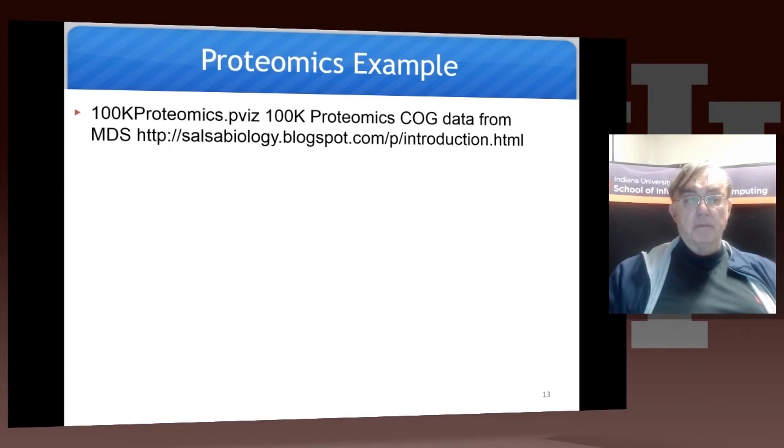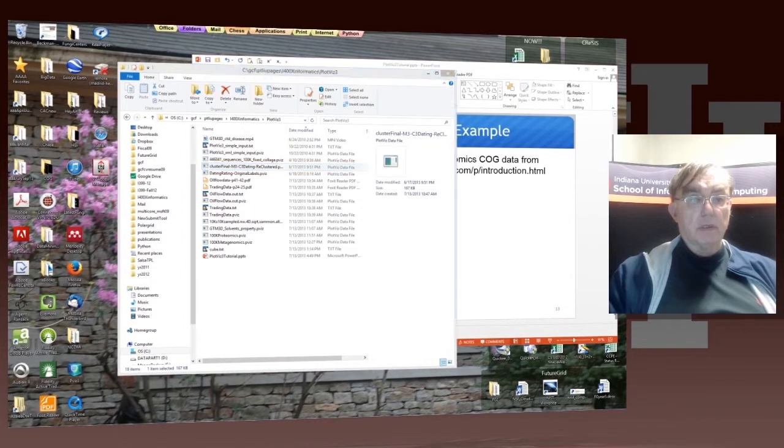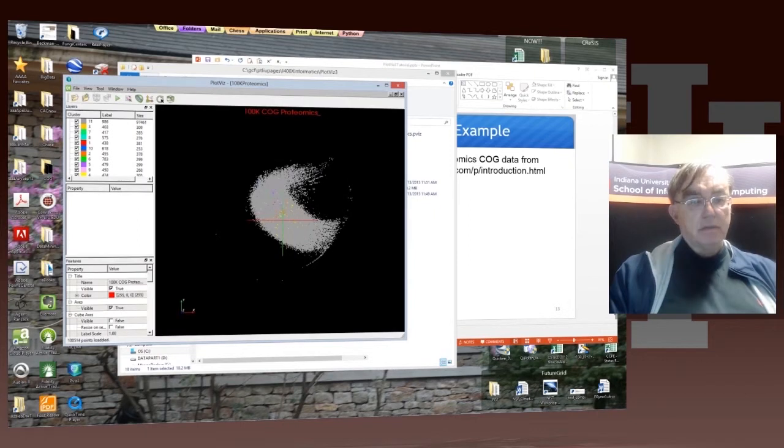Let's look at that for the full proteomics example. It's the same as we did the 10k proteomics points before, from the so-called COG data set. Now let's look at a much more effective 10 times bigger data set. And that's also on your resource. And it's called here 100k proteomics.pvis. It's just chucking up here, just to get going.